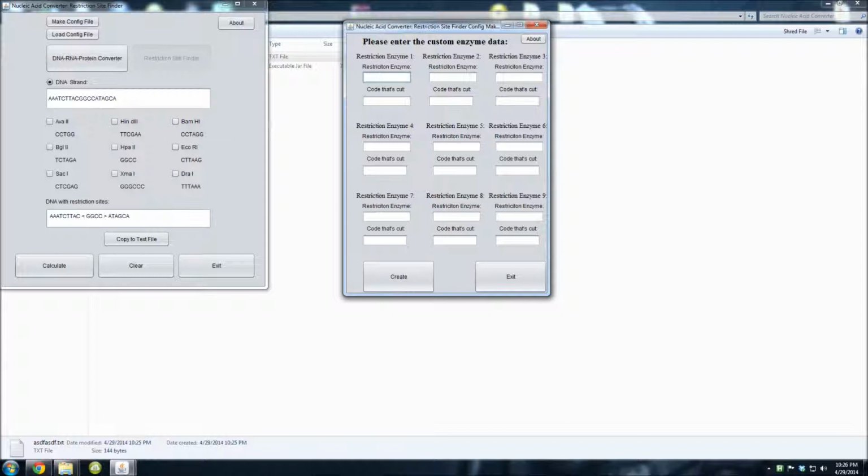So I'm just going to do some generic names like RE1, 2, 3, 4, 5, 6, 7, 8, 9.